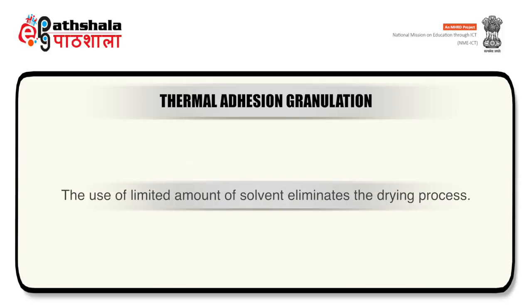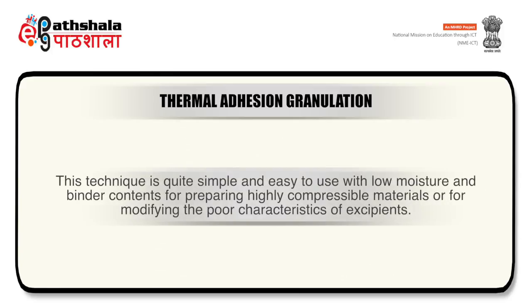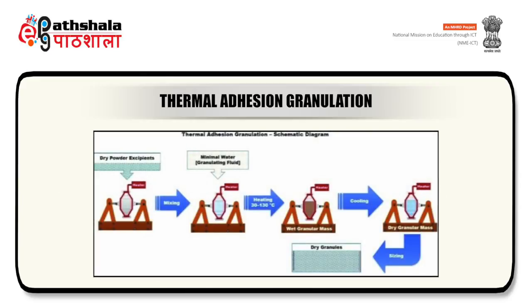The use of a limited amount of solvent eliminates the drying process. Granules of the required particle size can be obtained after cooling and sieving. This technique is quite simple and easy to use, with low moisture and binder contents, for preparing highly compressible materials or for modifying the poor characteristics of excipients. Also refer to the schematic diagram.